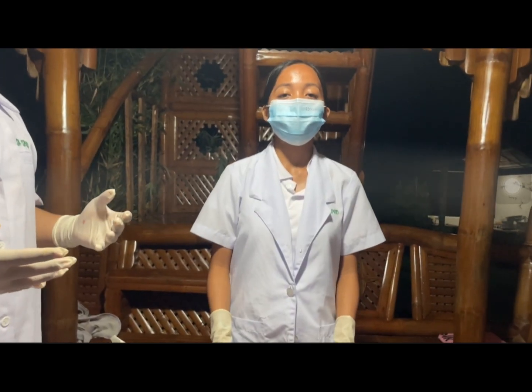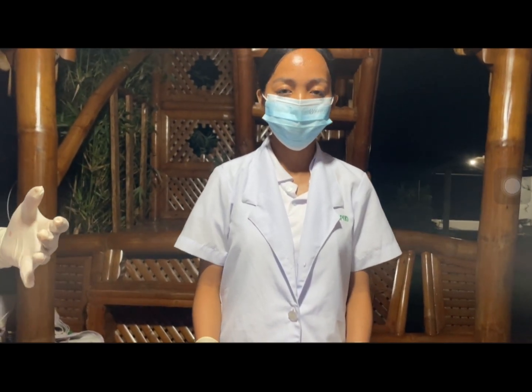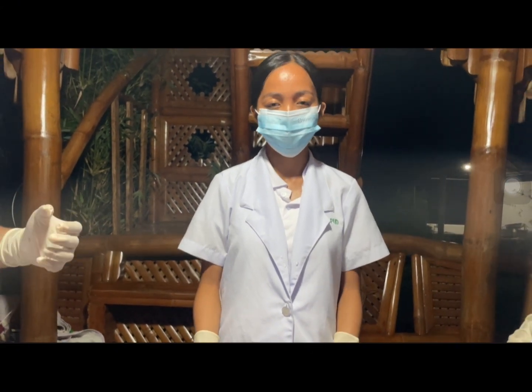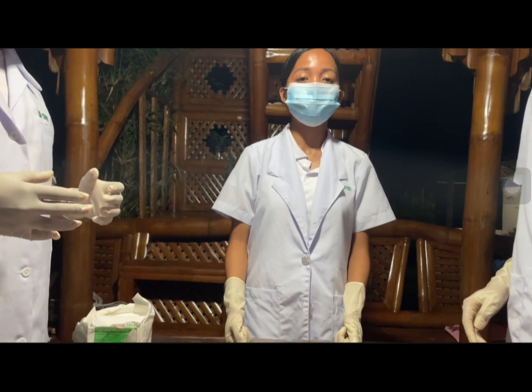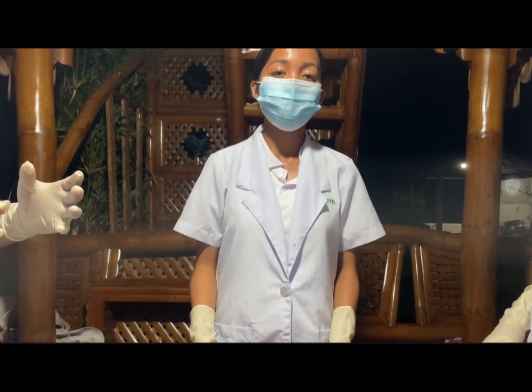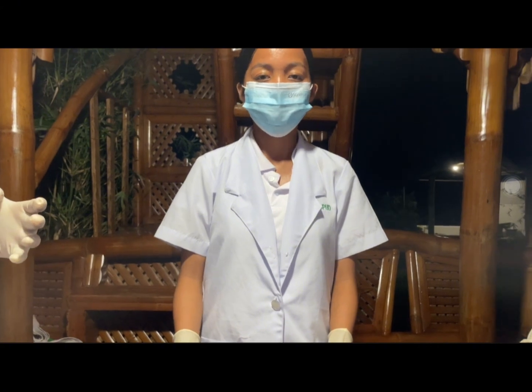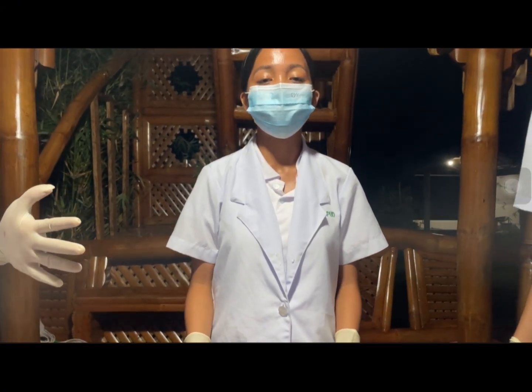So now that we are done dissecting the other parts of the gastrointestinal system, let us proceed to the kidney. Let us first know what the kidney is. The kidney is a vital organ in our body, primarily responsible for maintaining homeostasis by filtering blood and regulating various physiological processes. Before we dissect the kidney, let us first know its external and internal parts.